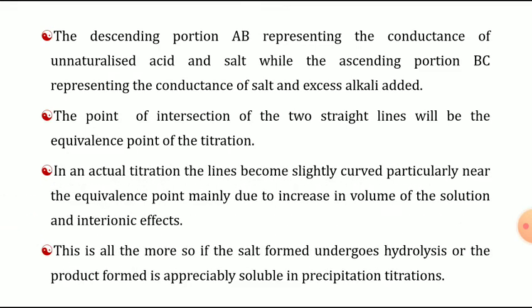This is all the more so if the salt formed undergoes hydrolysis or the product formed is appreciably soluble in precipitation titrations. Just before this slide, I told the entire procedure. So this is the remaining part of the graph explanation.